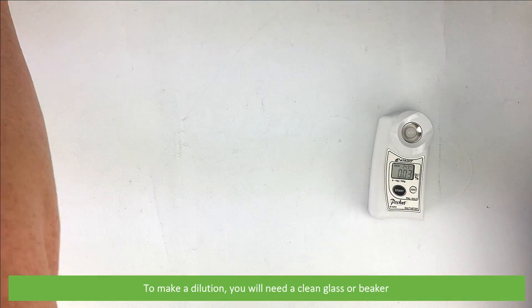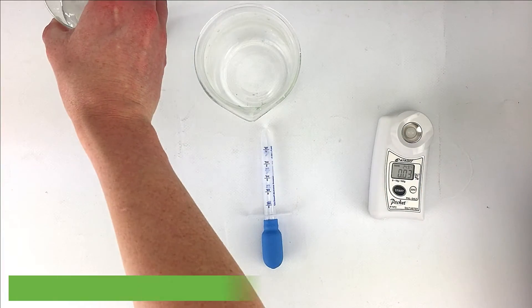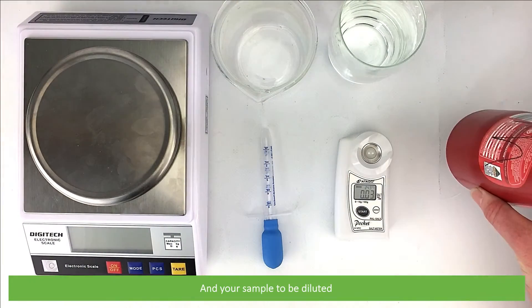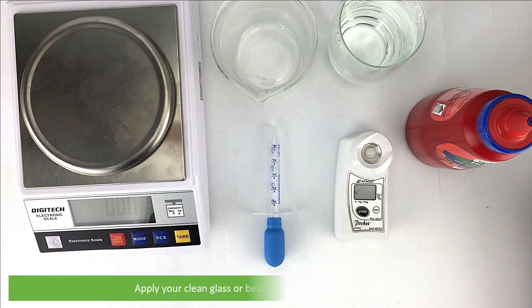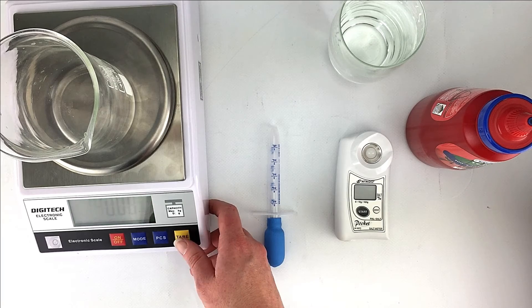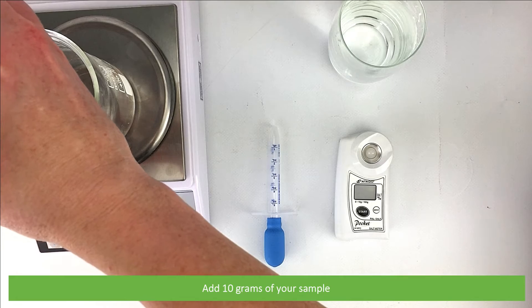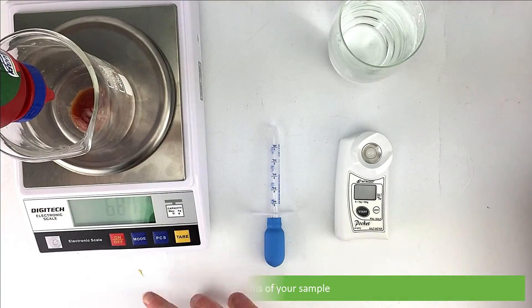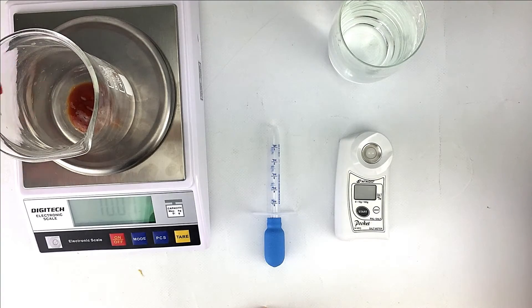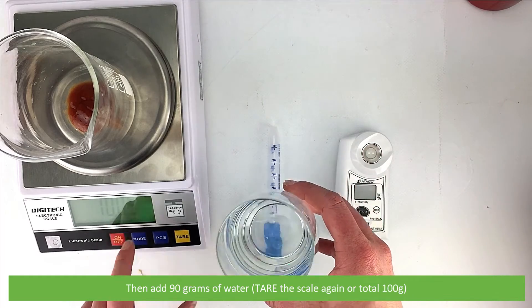To make a dilution, you'll need a clean glass or beaker, something to stir and move the solution — we are using a pipette — water, a scale, and your sample to be diluted. Apply your clean glass or beaker to the scale and press tare. Add 10 grams of your sample, then add 90 grams of water. You can either tare the scale again or total it to 100 grams.